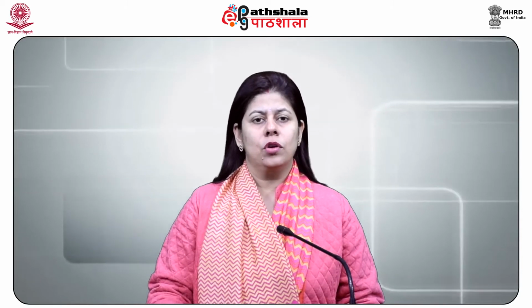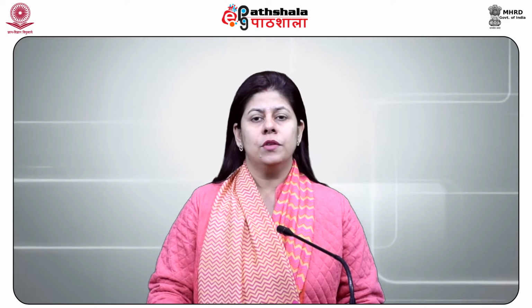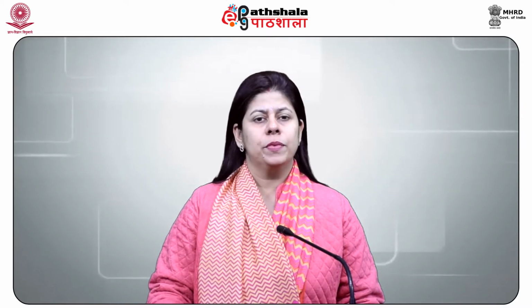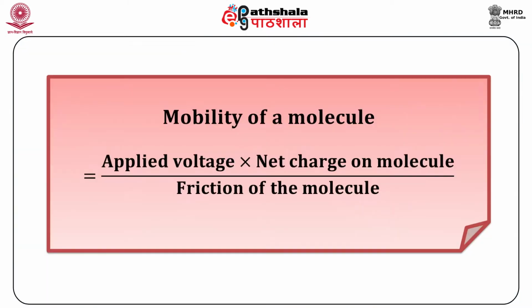Principle and methodology. All types of electrophoresis are directed by a single set of general principles illustrated by this equation. That is, the mobility of a molecule is equal to the product of applied voltage and net charge on the molecule divided by the friction of the molecule.